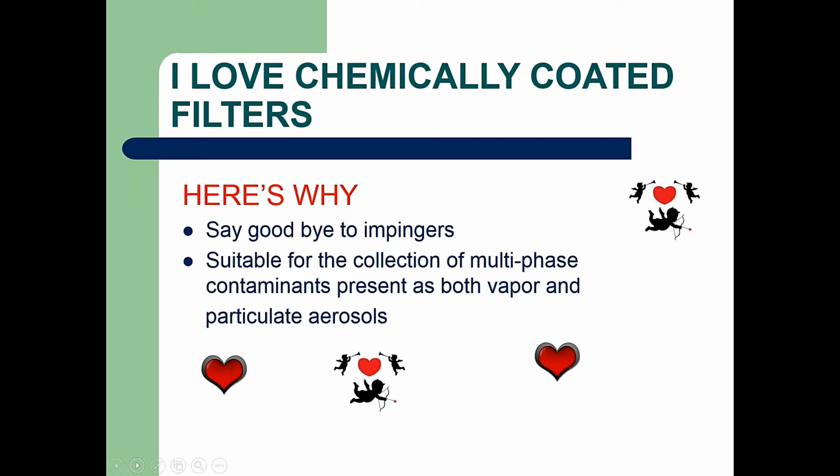In other words, compounds that may be present in the workplace, both in the vapor and aerosol phase. For example, the U.S. OSHA methods for isocyanates use chemically coated filters because spraying operations for these compounds can produce both vapors and small droplets of isocyanate materials. And both are effectively trapped onto a chemically coated filter. And in this case, OSHA recommends open face sampling.